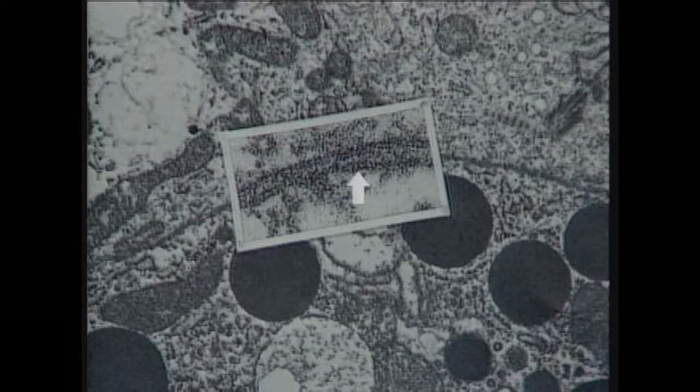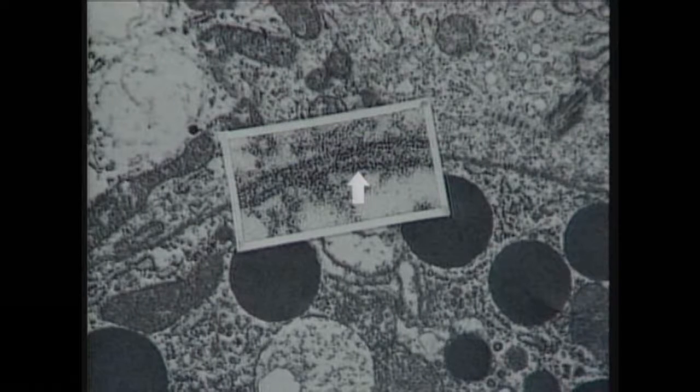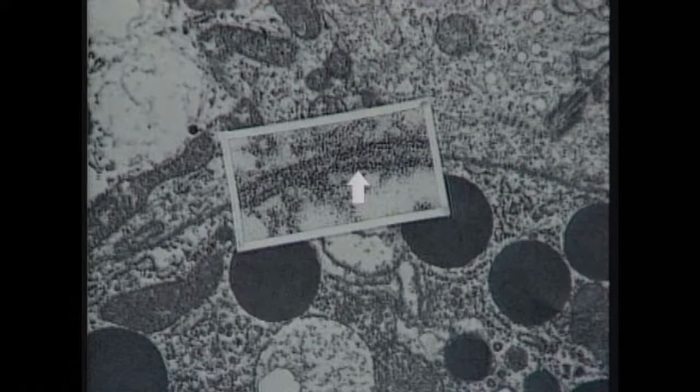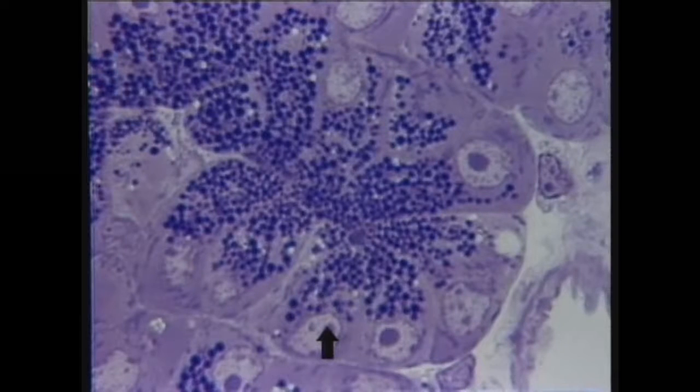When first seen, this was called the unit membrane because membranes that surround cells look ultrastructurally like the membranes that surround cellular organelles. Biochemically, they can be very different. There's a major take-home point that I want you to think about: although the cell membrane looks quite similar along its entire circumference, patches of cell membrane can vary dramatically from one area to another. So the homogeneous structure you see under the electron microscope does not give a clue as to the tremendous biochemical diversity manifest by cell membranes at different points along their borders.